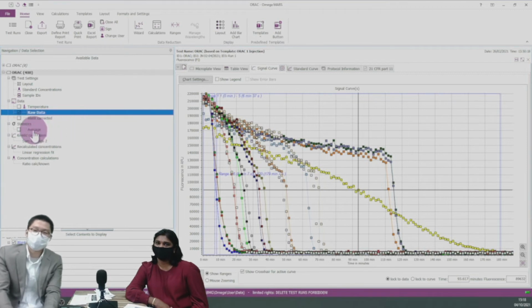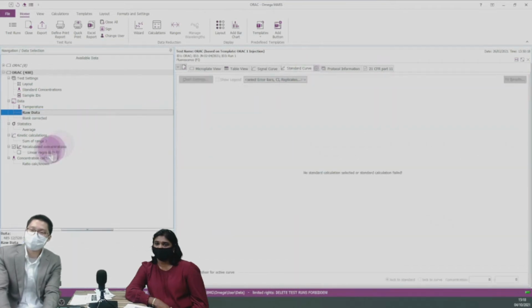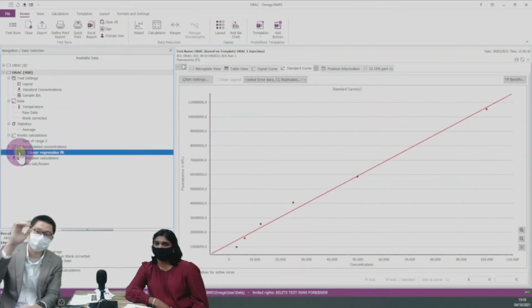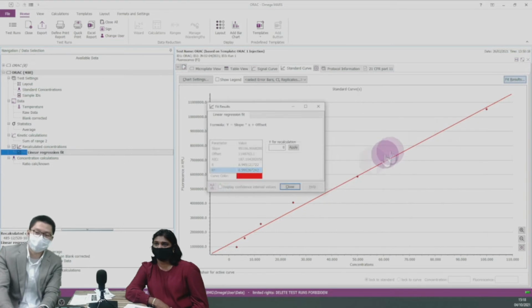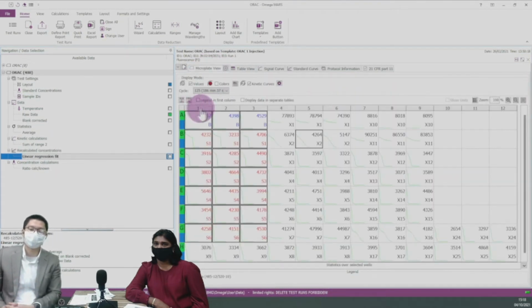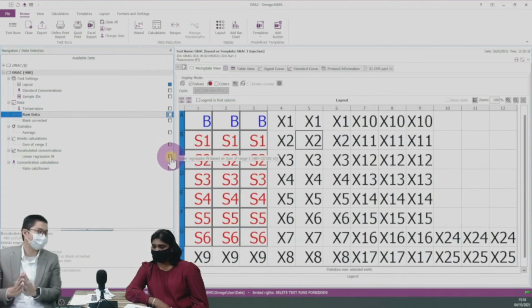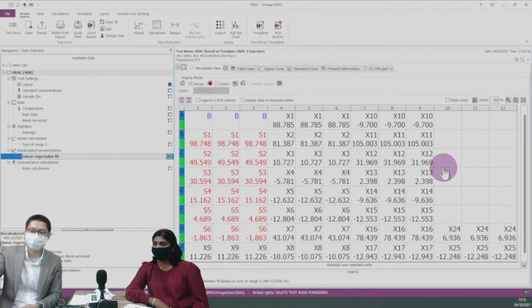We can also do all sorts of things, blank correction, average, because we have triplicates and blanks here, and we can apply all this data there. The next thing that I'm going to show is the standard curve creation. All these are already done automatically, so you just need to tick to show the curve. Here we have quite a nice standard curve based on the Trolox standard that we use, and these are the fit results. Using that standard curve, we can automatically calculate the final data that we want, which is the ORAC value, using this method. Just tick that, and then you can see the concentration of the unknown samples here.